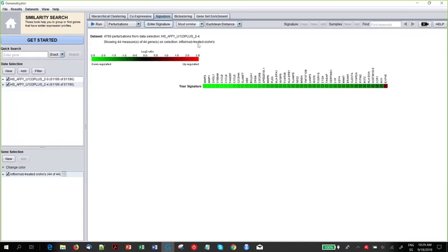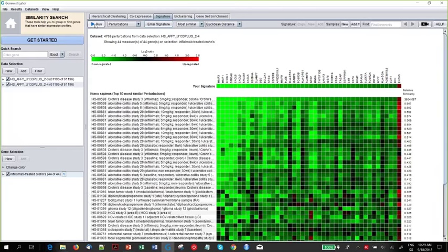So we've set it to the most similar, and what the signature tool does is search for as similar profiles as possible. And we're getting the results when we click run here. We get the results completely based on the values of expression, so the expression regulation. It's very transparent. You see exactly how similar these expression profiles are in their up and down regulation. So the results that you see here, each row is a comparison between two groups of samples. In this case, many of them are treated responsive IBD patients versus untreated.